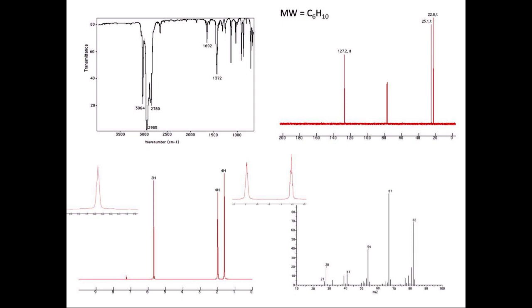These must be on the alkene, because you see their parts per million come in between 4 and 6, and that means that they're going to be on the alkene. The other thing that I can pick out from this particular piece of data is that there are no methyl groups, which means there's no CH3s.